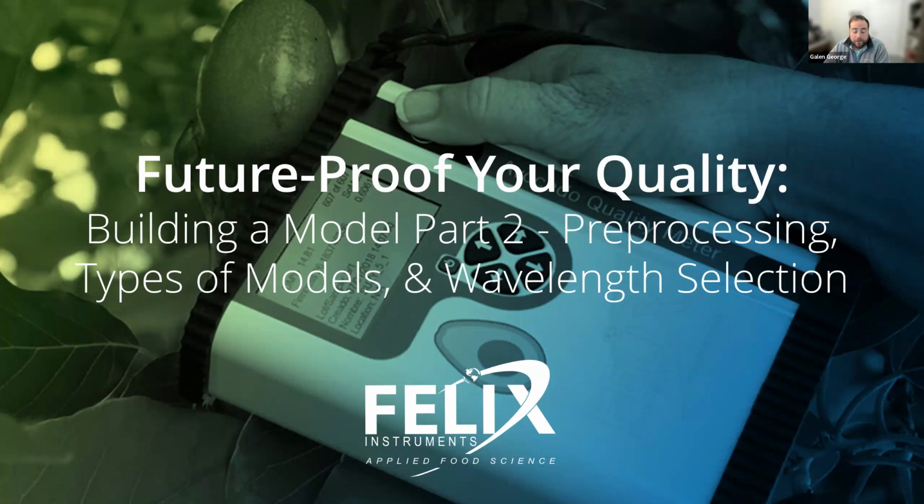This is the third webinar in our 6-part series about practical chemometrics in the agriculture sector. Today's webinar is going to be the second part of the building a model portion of the webinar series. And today we'll be talking about pre-processing, types of models, and wavelength selection.